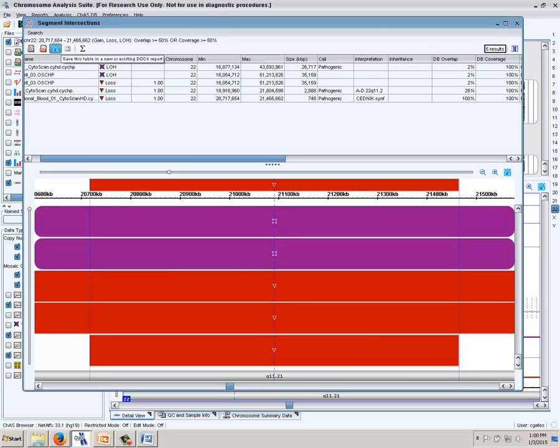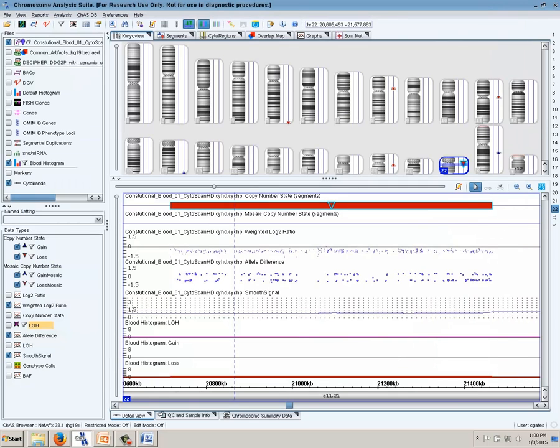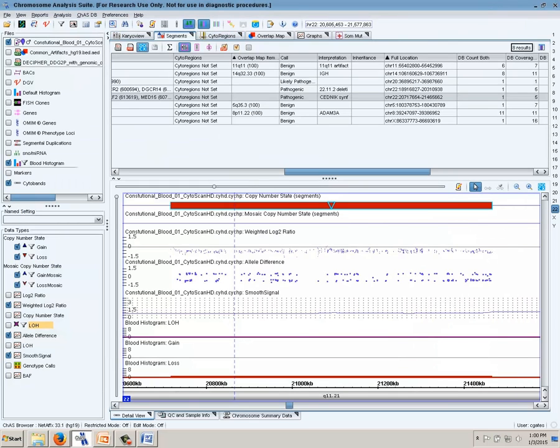For instance here, this table, or you'll see it in the segments view or the cyto regions, for quick exporting, just like you had with the PDF format. So some of the enhancements that we've done to reports is to make it more flexible and more streamlined, so that you can choose multiple reports at one time as opposed to having to do one at a time. Appending the file name at the bottom, as well as having the automatic launch and the automatic naming of the CHIP file.